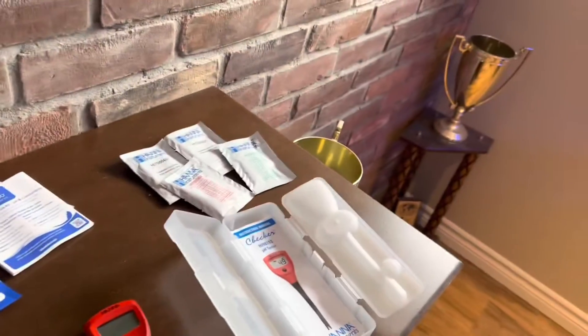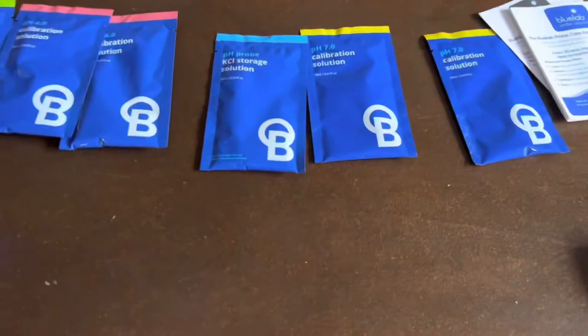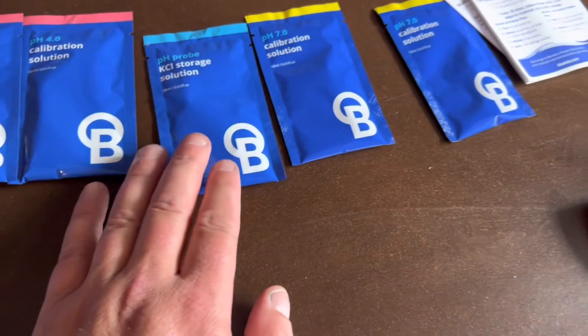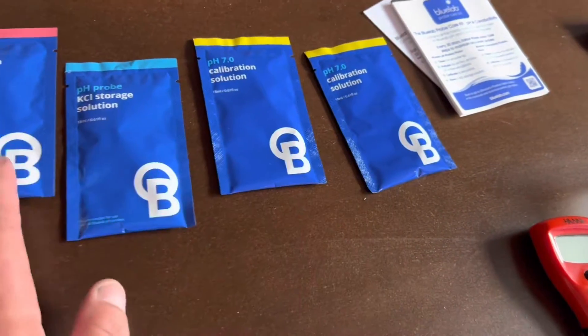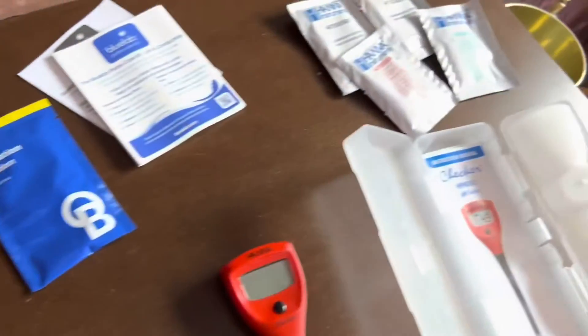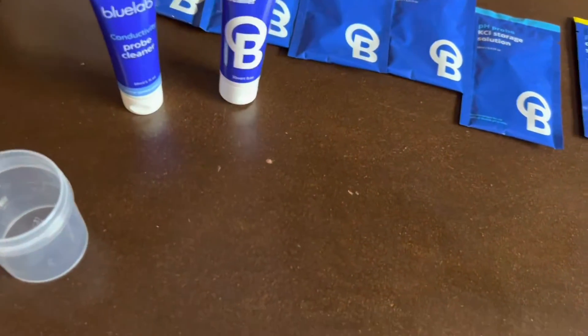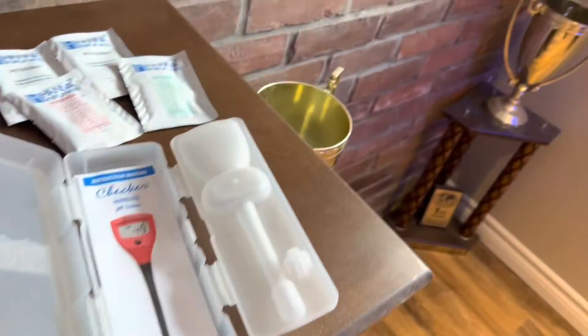What's good about this Blue Lab kit is you get storage solution — which is potassium chloride — you get two of them, I've already used one. You get some calibration solution again at pH 4 and 7, so when we run out of the Hannah ones we've got these. And then we also have probe cleaner — two bottles of probe cleaner and a little brush, all that kind of stuff.